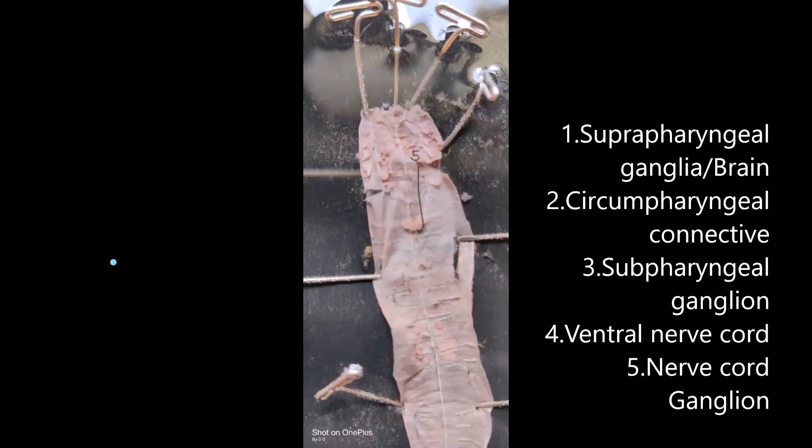Once you clear the entire digestive tract, you will be able to see the nerve cord running on the ventral side and at the anterior end, the nerve ring.